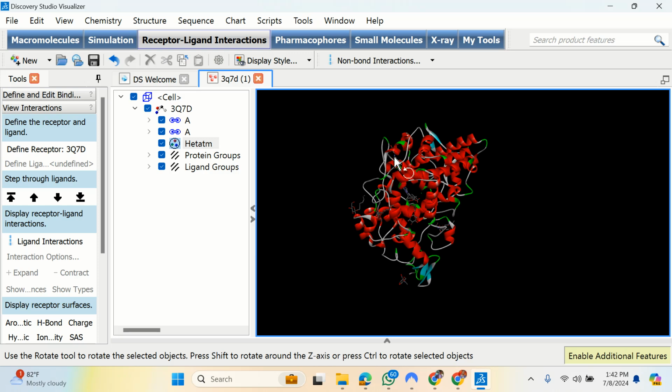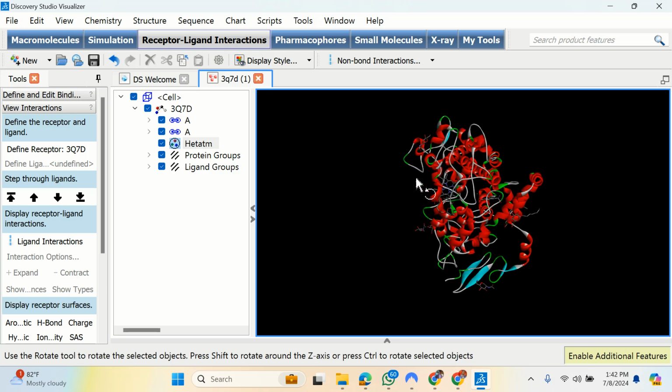Okay, some of these metallic units, like calcium, magnesium, some proteins use these in the course of their catalysis. So while elucidating them, you still find them in the structure. However, you take off all that, just to keep your protein safe from clashing with any kind of interaction, except your literature indicates that it is necessary. Right? So that is that.